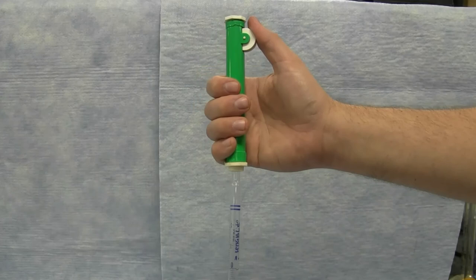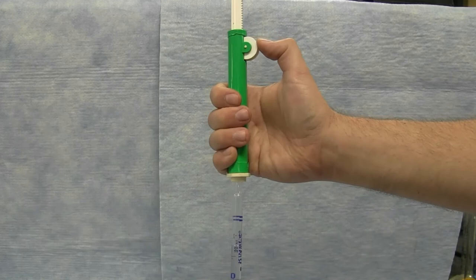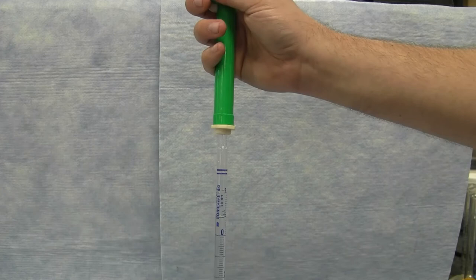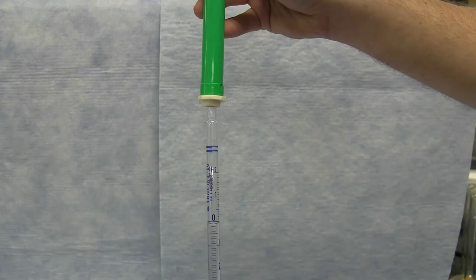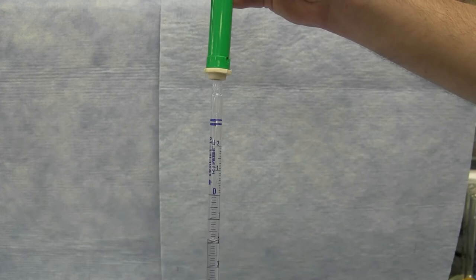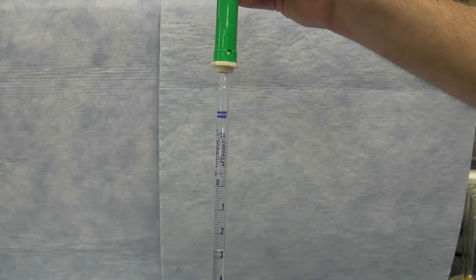As with the pipette bulb, you can draw liquid up into the pipette itself to the appropriate level. With the pipette pump, you can dispense the liquid itself by reversing the direction of the wheel. As you do this, the liquid level is decreasing in the pipette. The numbers on the pipette are increasing, indicating this is the volume that was dispensed from the pipette itself.